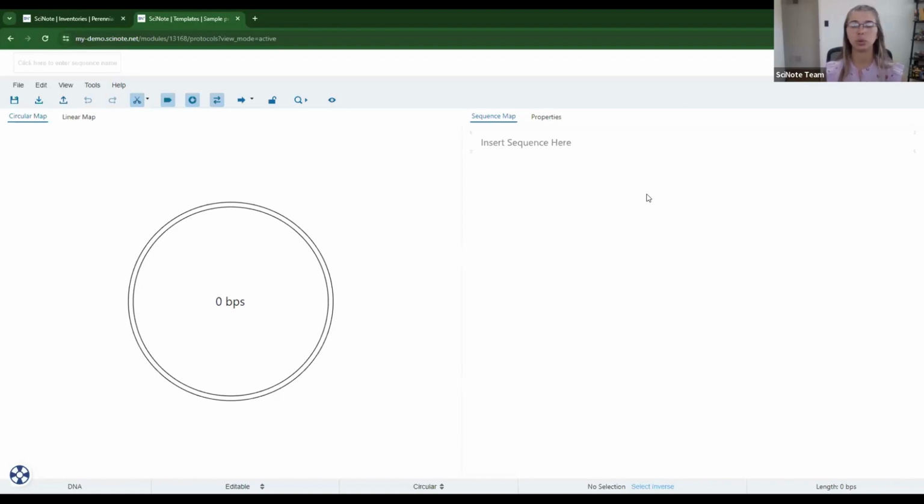Because this is a tool that we have integrated with us, and it's not like ChemDraw, where it is with ChemDraw, and we can take that feedback so that we can continue to improve this tool as we see is needed, based off of, like I said, the feedback that we are receiving.